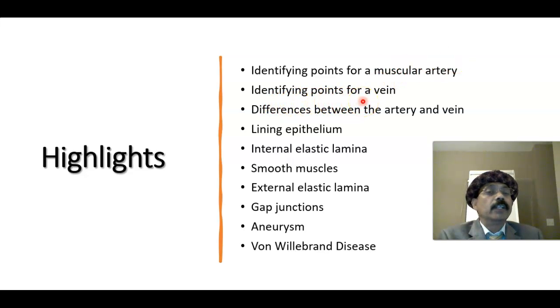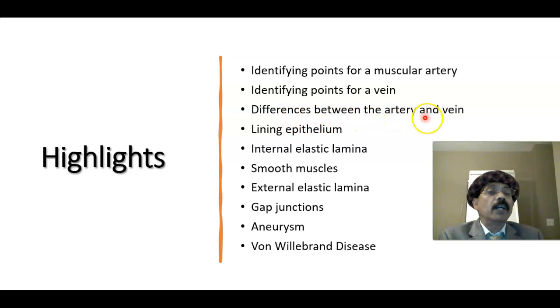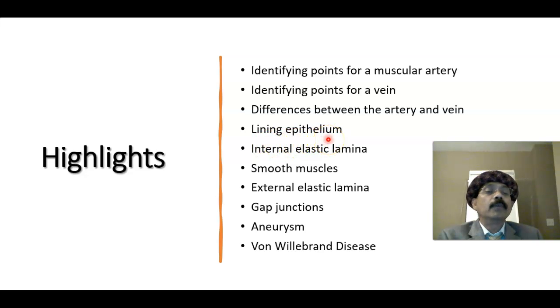The internal elastic lamina and the thick tunica media containing several layers of muscle are key identifying features, along with the tunica adventitia containing vasa vasorum. All three layers — tunica intima, tunica media, and tunica adventitia — are present, but tunica media is very thick. To differentiate artery from vein: artery has thick walls and a circular shape, while the vein has thin walls and is collapsible. Endothelial cells communicate with underlying smooth muscle through fenestrations of the internal elastic lamina via gap junctions, and gap junctions also exist between smooth muscle cells.